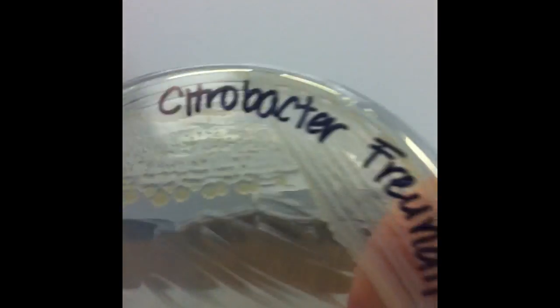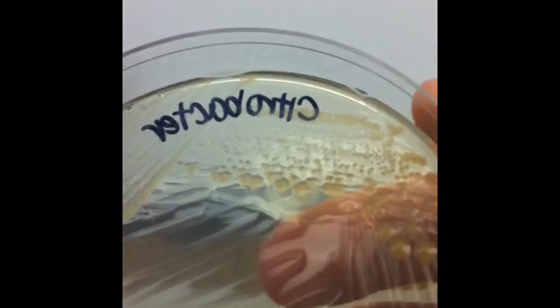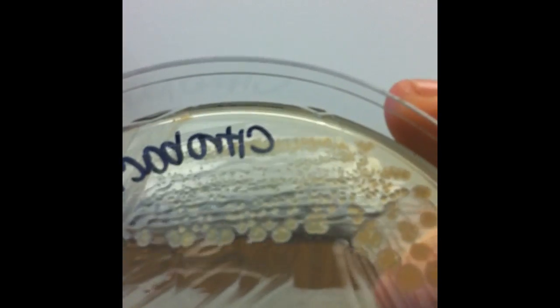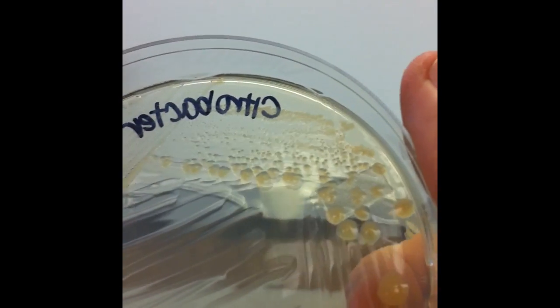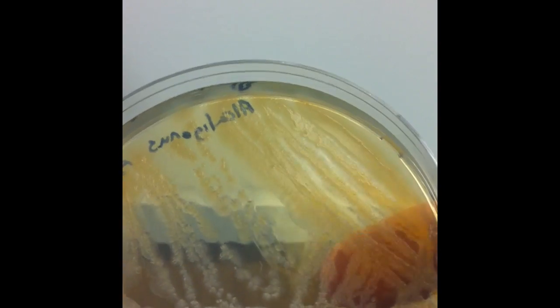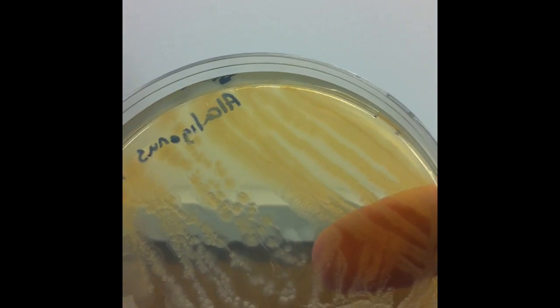Next we have Citrobacter freundii. Citrobacter, some obvious white colonies that are slightly irregular, a little bit umbonate with a tall center. Citrobacter. Here we have Alcaligenes faecalis. We've got a pretty aggressive grower here. It has irregular colonies. A little bit of coloration maybe to the media, but we have kind of a mostly white to cream color irregular colony for Alcaligenes.